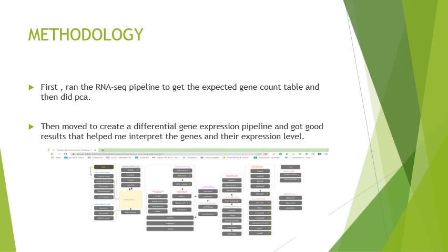After which I moved on to the PCA, and finally I developed a pipeline for the differential gene expression, through which I got very good results, which I'll show you in the later slides. And that helped me to interpret the level of expression of the genes and how those genes were expressing in the darker versus the lighter skinned people.